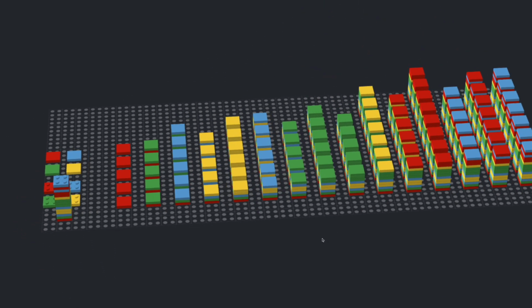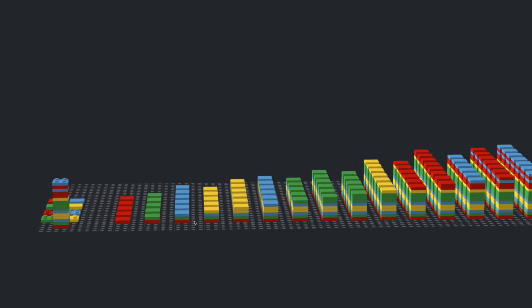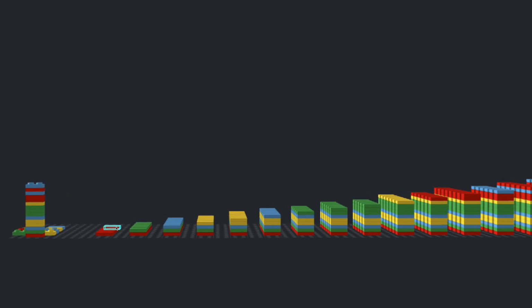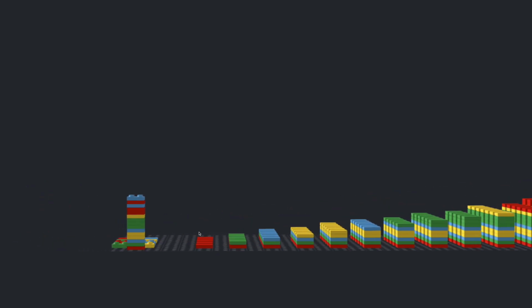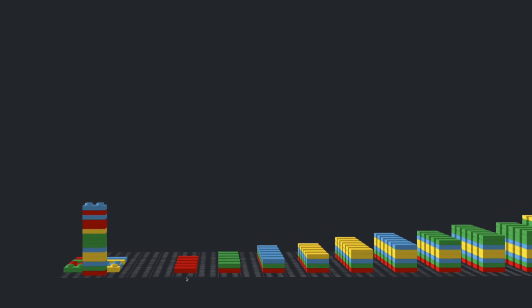So now you can imagine all of these blocks being run through a capillary on a capillary electrophoresis instrument. They're all going to migrate at different rates, with the smaller blocks moving faster through the capillary than the larger blocks. And so the smaller blocks pass through the detector within the capillary, and that fluorophore on the final block is excited.